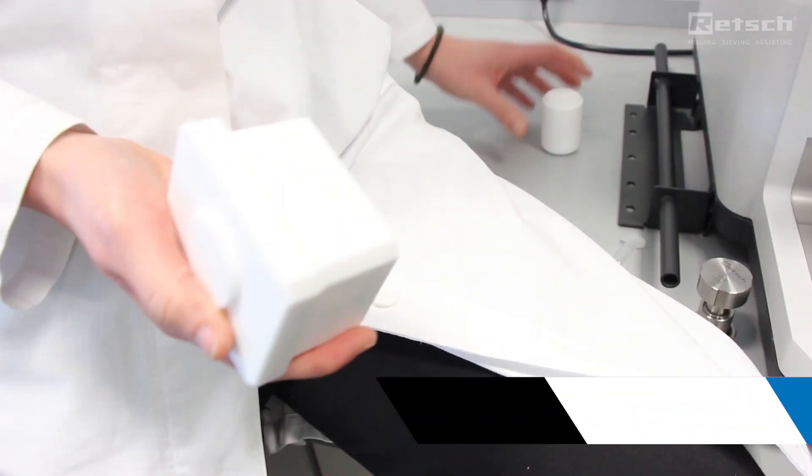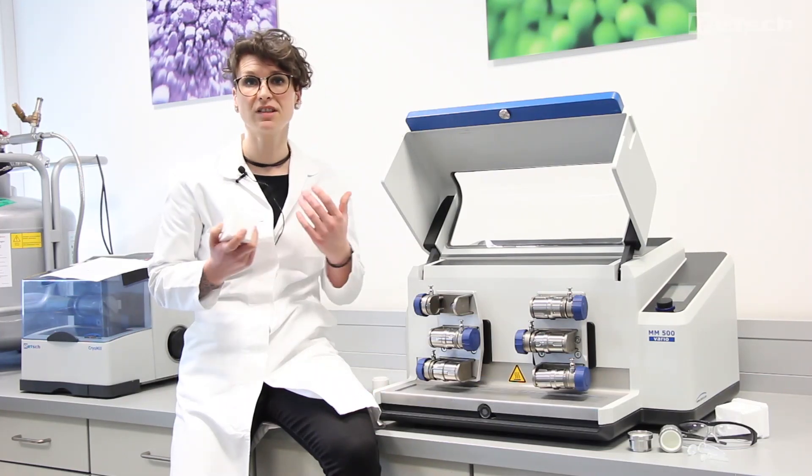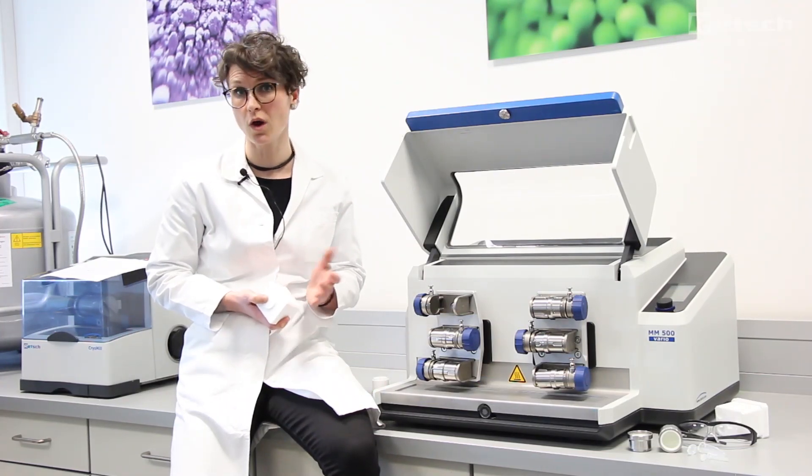It is also possible to clamp various adapters for single-use vials. You can process multiple vials for DNA extraction in only one batch.